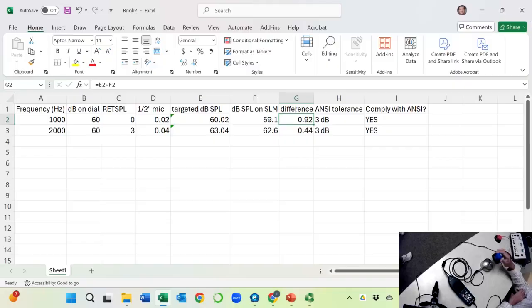Does that make sense? The chamber will be 6 cc. Do not take the cushion out. The cushion is part of the calibration. The cushion is necessary for calibration. If you take the cushion out, it won't sit properly, and it might fall off.